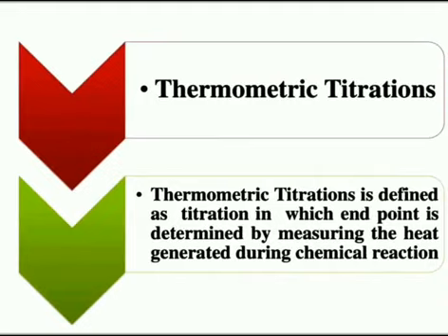Now we need to know what thermometric titration is. Thermometric titration is defined as the titration in which the endpoint is determined by measuring the heat generated during chemical reactions. Here it is like volumetric titration, but we are going to measure the heat generated during the chemical reactions.